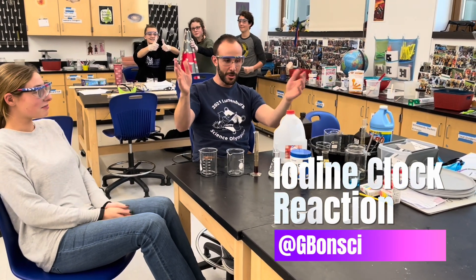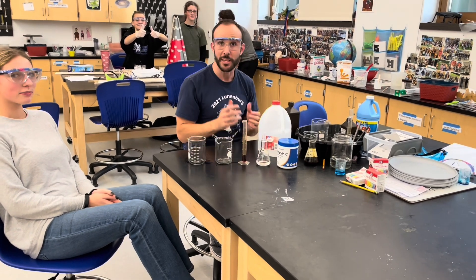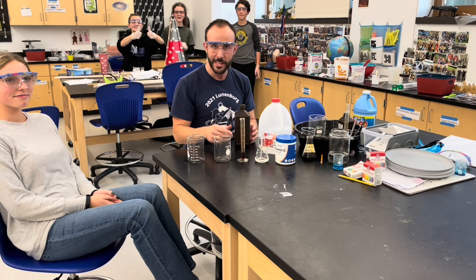Hey class, this is a quick little demo that you can do — it's called the iodine clock reaction. It's a really fun, colorful demo, and you don't need a lot of really tough supplies to get.